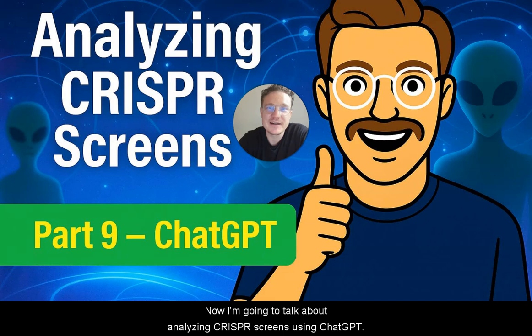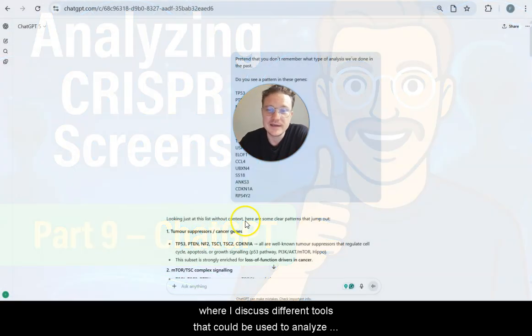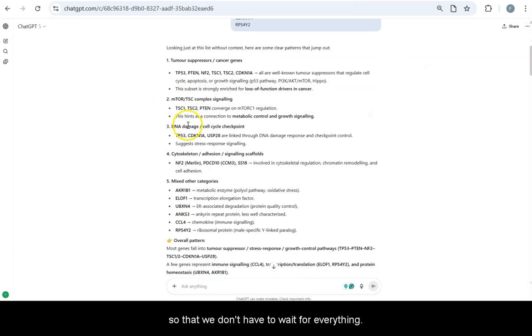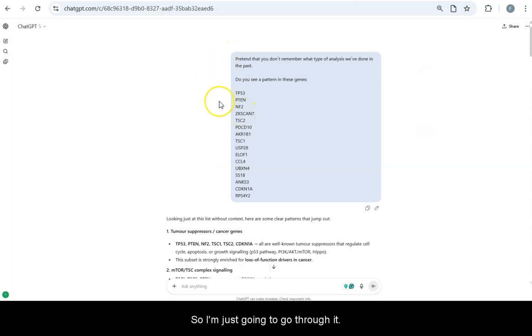Now I'm going to talk about analyzing CRISPR screens using ChatGPT. And as you know, this is a series of videos where I discuss different tools that can be used to analyze CRISPR screen data. I've already started this discussion with ChatGPT so that we don't have to wait for everything. So I'm just going to go through it.